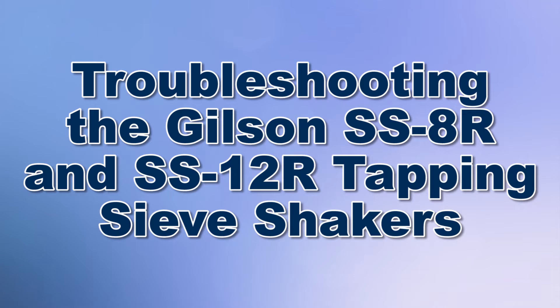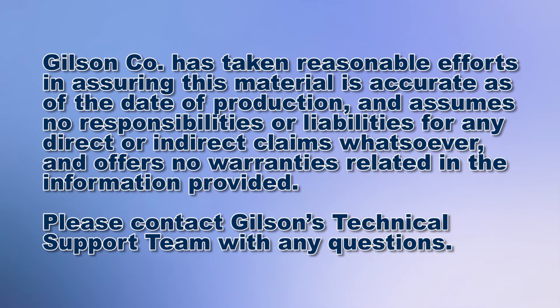Today we're going to demonstrate how to troubleshoot the Gilson SS-8R and SS-12R tapping sieve shaker.